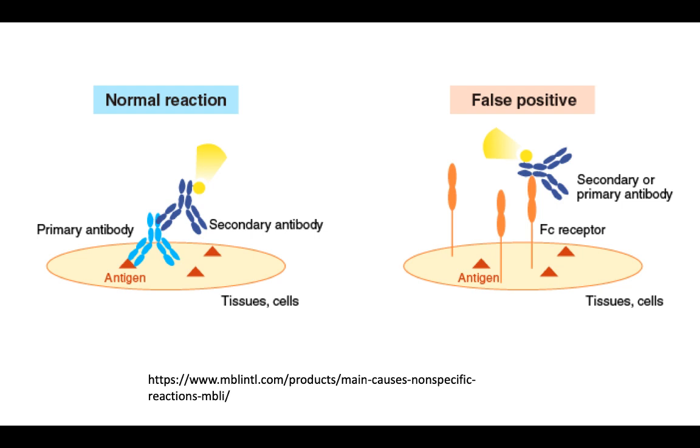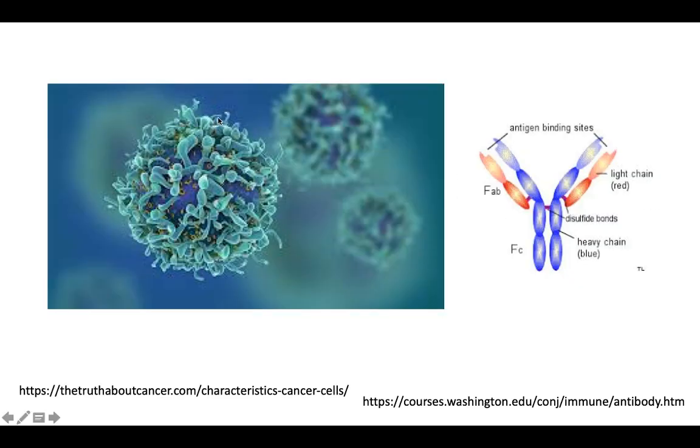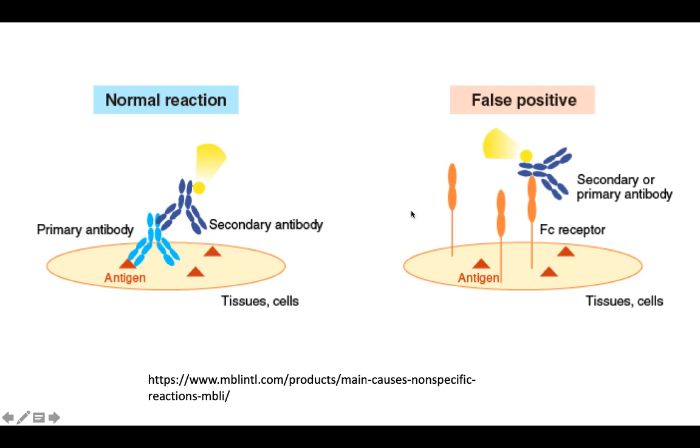So here you can see this is something that I would call an antigen. Anything where an antibody is going to bind is an antigen, or an epitope, some sort of material on the cell that acts as a biological gateway or a recognition factor could be called an antigen. So right here is an antigen, in a simplified diagram.